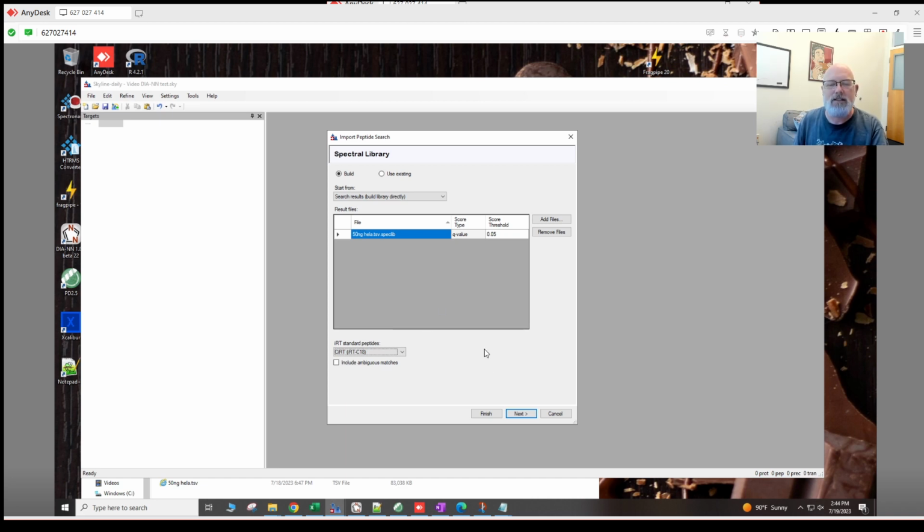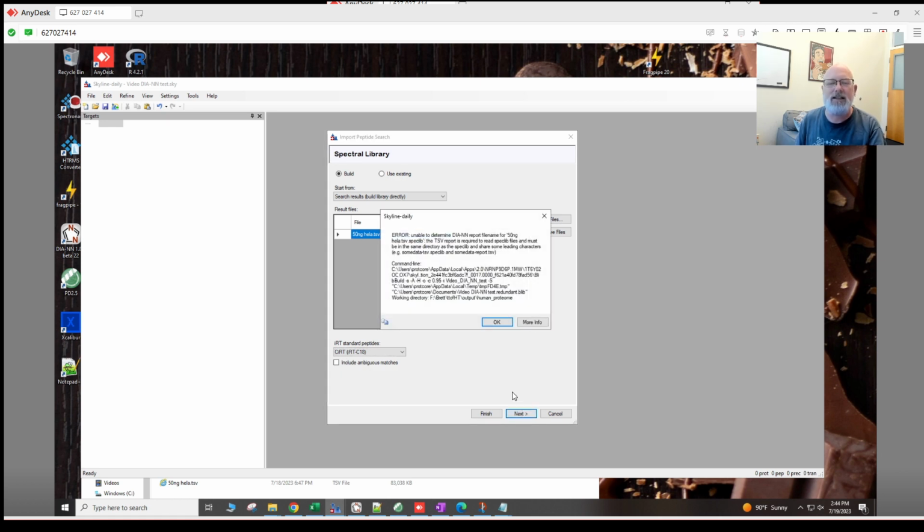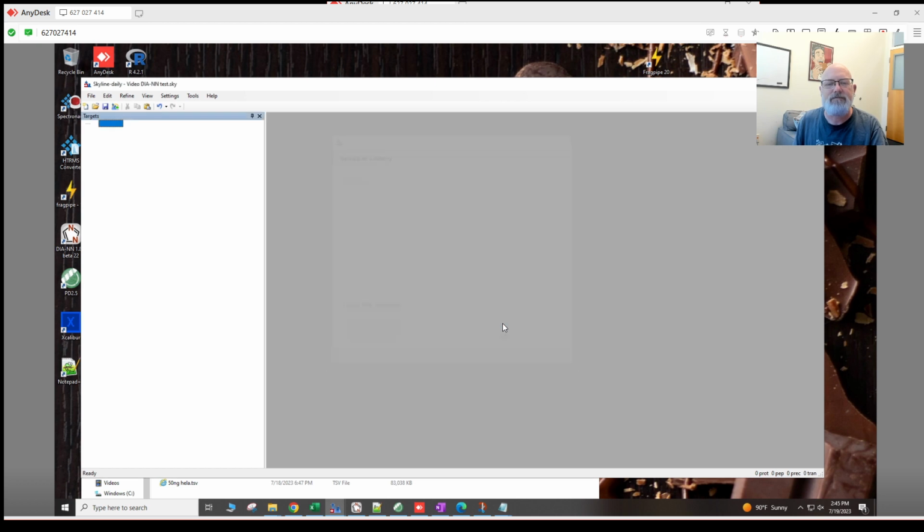Okay, let's see if this works. And it will probably give me an error. If it doesn't, I've already fixed it, and I'll have to go back. Yes, all right. So it gives you an error. It says unable to determine DIANN report file name for 50 nanograms. This is kind of a bug as far as I know in the library building methods. So you can ignore all this stuff it tells you, and we're going to fix it.